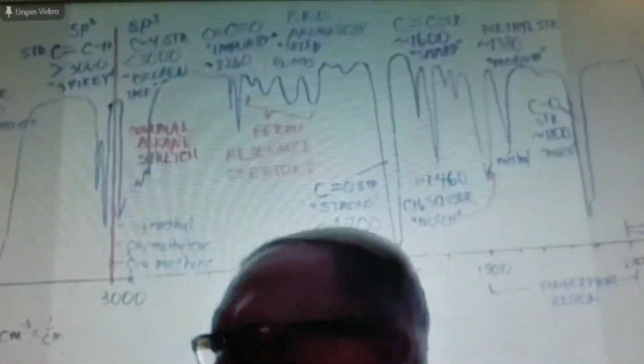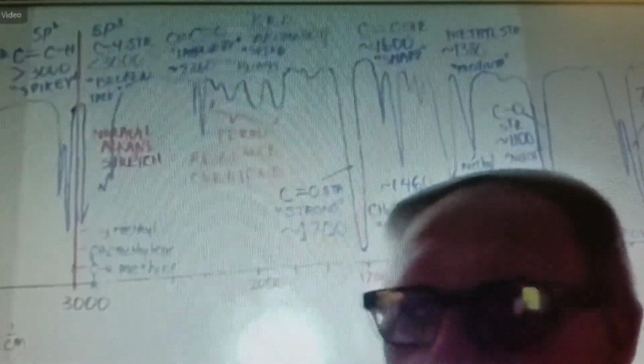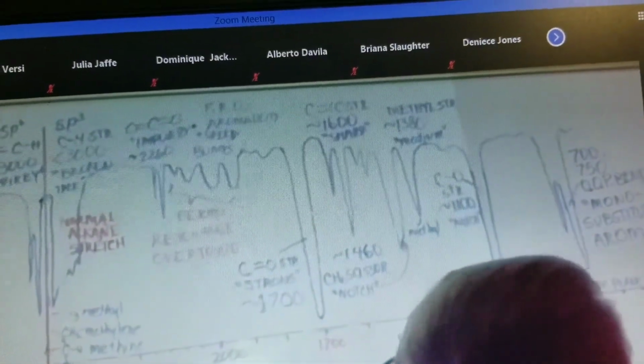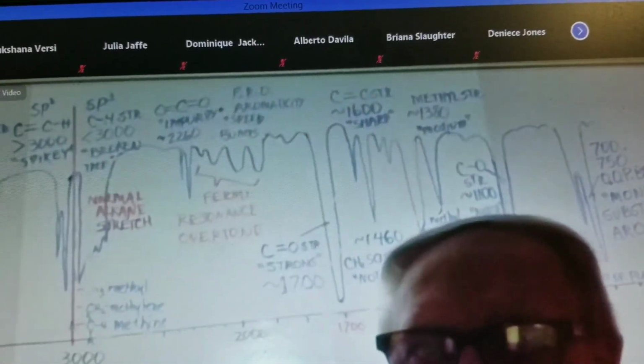But the easiest way to do that is sparge it, or put an air stone, a stainless steel air stone, into the sample, turn on the nitrogen gas, and bubble some nitrogen through it for about 2 minutes, and it'll take all the CO2 out. You won't see it in the book, but when you guys do one, every one of you will have it. And you can try it.